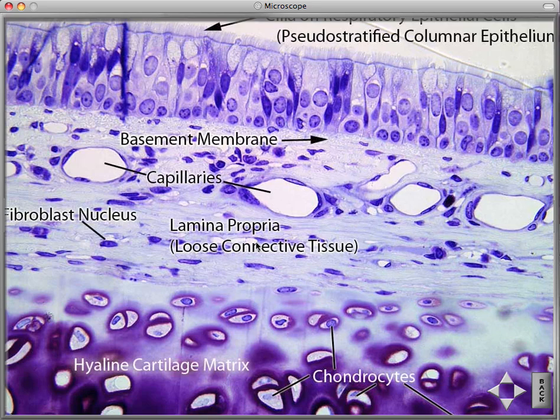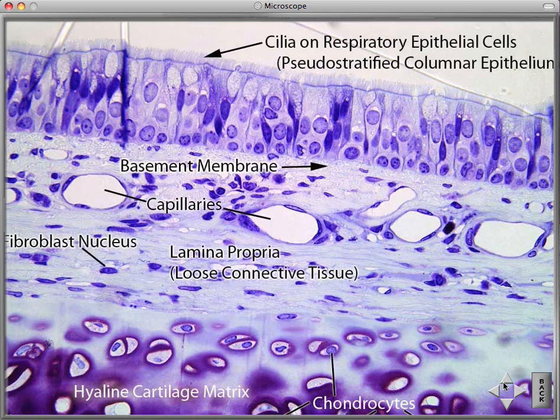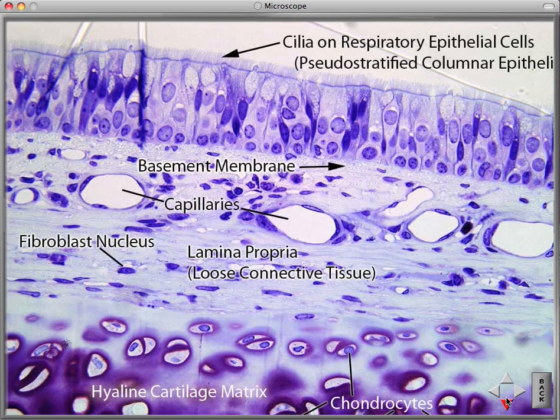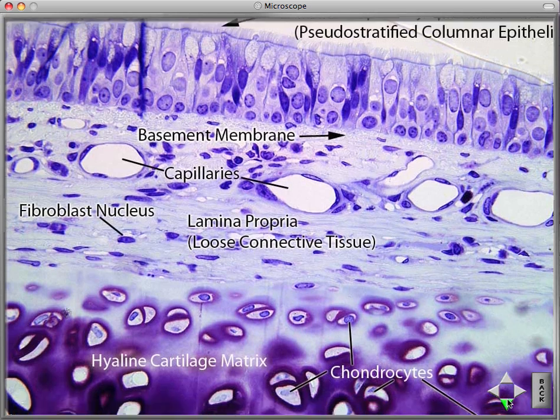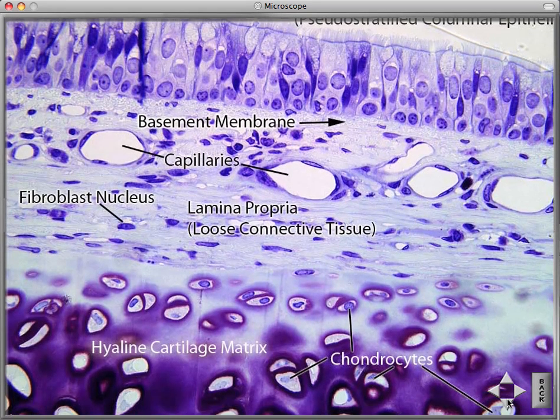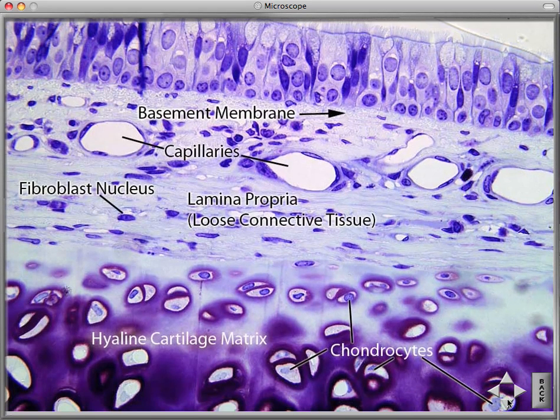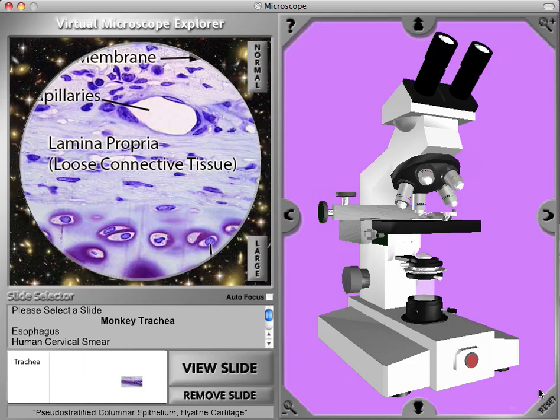Here we see the cilia, ciliated pseudostratified columnar epithelium, the basement membrane, capillaries, fibroblasts, this fibroblast nucleus, the loose connective tissue, and the hyaline cartilage matrix, and the chondrocytes that secrete the matrix.